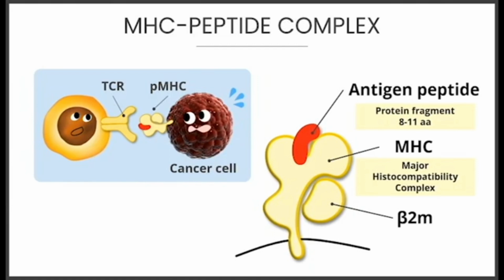Each peptide MHC class I complex is composed of an alpha chain, non-MHC beta-2M, and antigen. In the case of cancer cells, the antigen peptide loaded on the MHC is a fragment of multiple proteins expressed inside the cell. TCR recognizes each individual complex and assigns cellular identity.